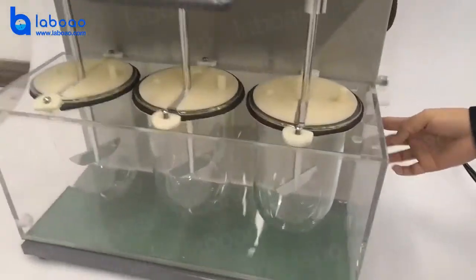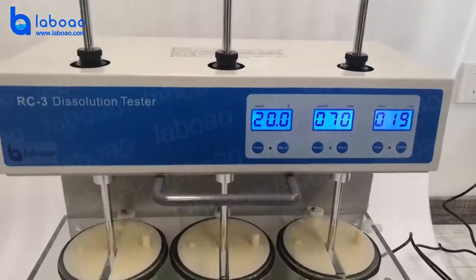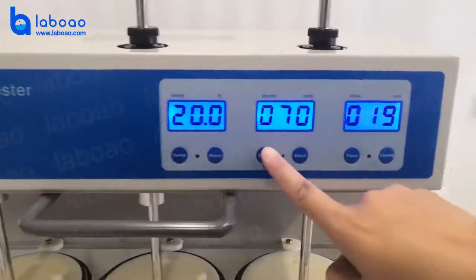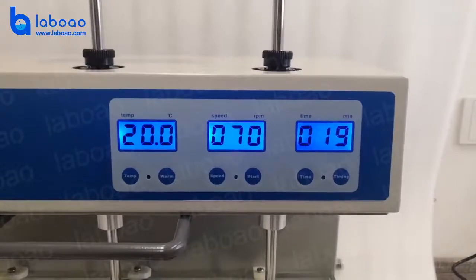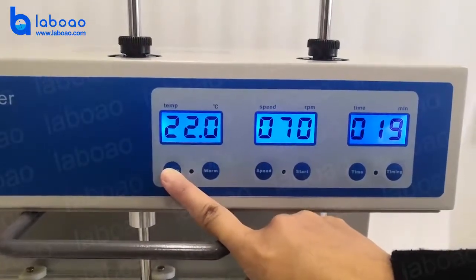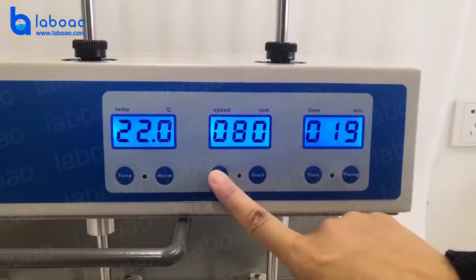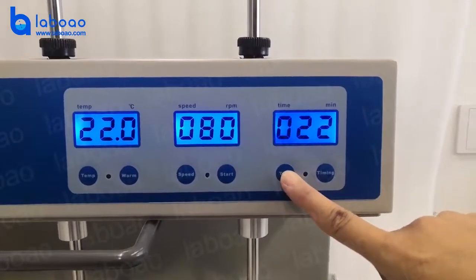Power on. You will see three data on the screen: temperature, speed, and time. All the data is adjustable. The max temperature is 45. Max speed is 200 RPM. Max time is 900 minutes.